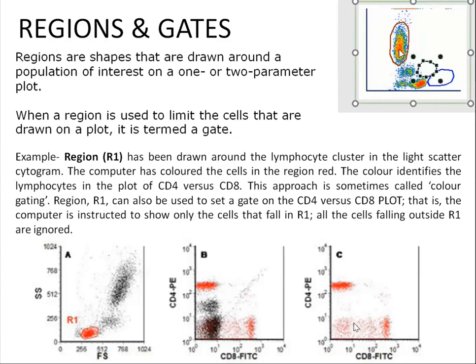But as you become experienced, we use this term interchangeably. We say, that's a gating marker, you gate this population. But this is the actual flow cytometry language, this is the correct one. So I want you to know this.